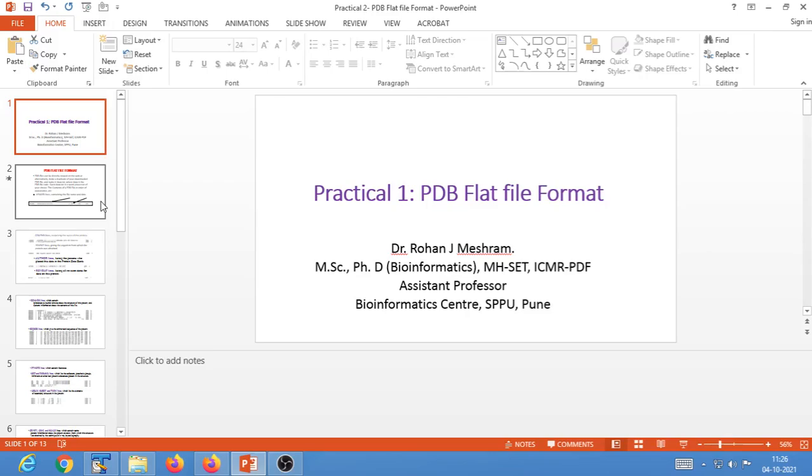if you know what things in your PDB file need to be changed, where exactly to locate that data, and how to make those changes, so as to make that protein model as you want to work with. So keeping this in mind, it is very important that you should know how the structural data is arranged in a typical PDB file. So let us start with this.